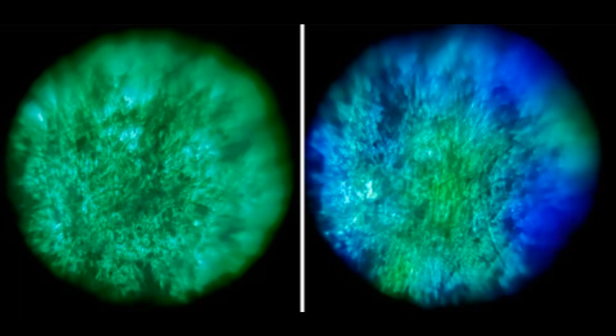What other ways can you think of to study color mixing under your Foldscope? What other color combinations can you make? Share your microscopic images on the Microcosmos and use social media to tag us with the results of your explorations, creations, and discoveries. We love to see how Foldscopers around the world are using their Foldscopes in new and innovative ways.